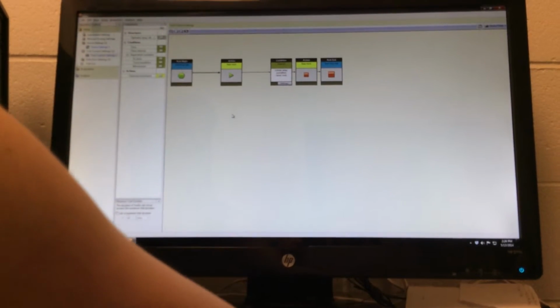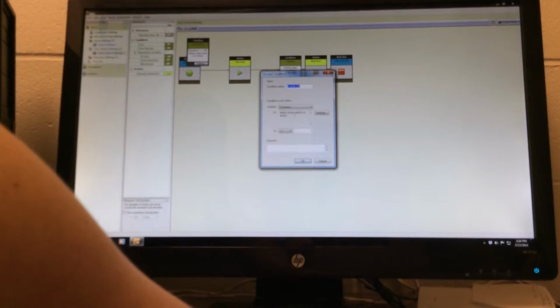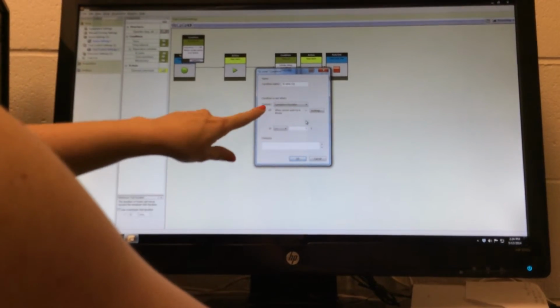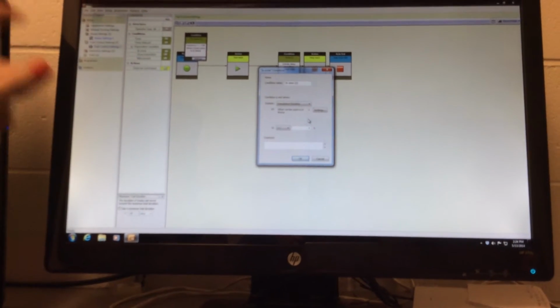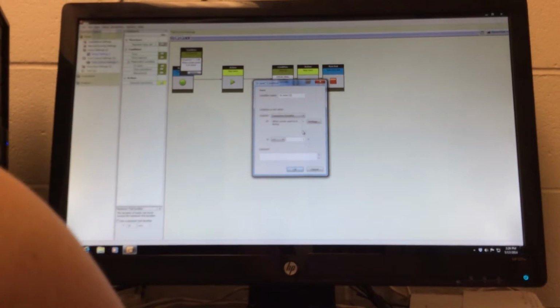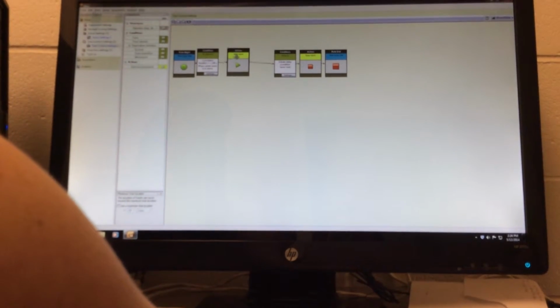So normally this is what it looks like. I'm going to put this condition of zone in here, and change this to cumulative duration. So this is saying when the animal's center point has been detected in the arena for at least 1 second, let's say okay, drop that in, only then will it start tracking.